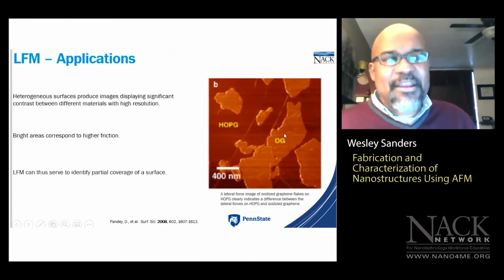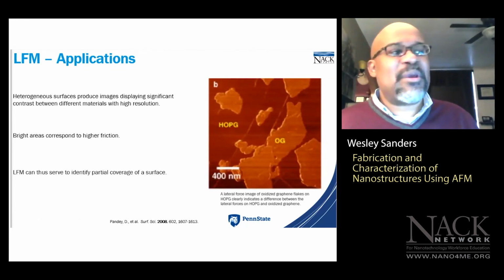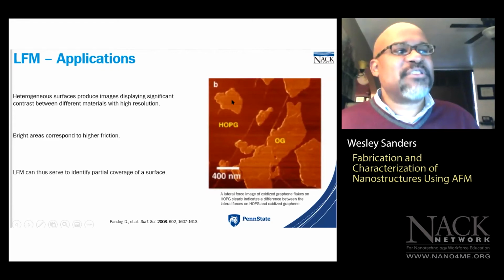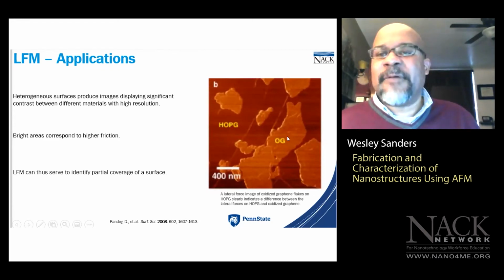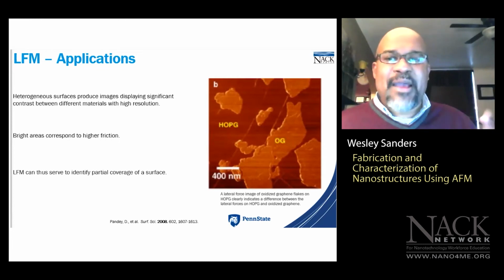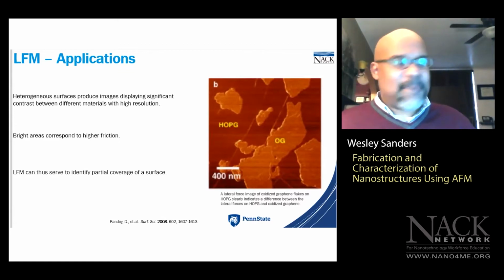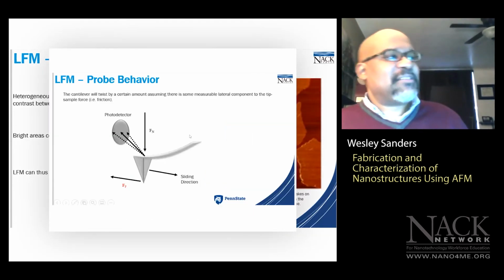Well, the areas that exhibit higher coefficients of friction or rougher areas, they appear brighter in lateral force microscope images, right? The rougher areas or rougher surfaces appear brighter in a lateral force microscope image. Now, why is that? Let me go back to this. Let me go back to this image here.